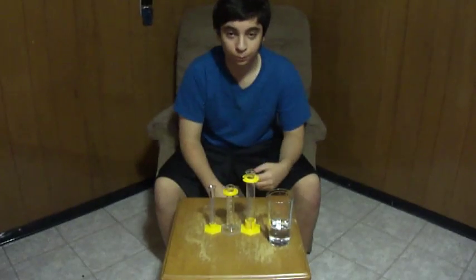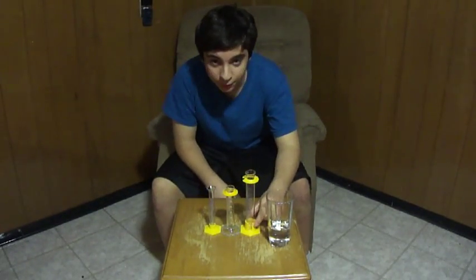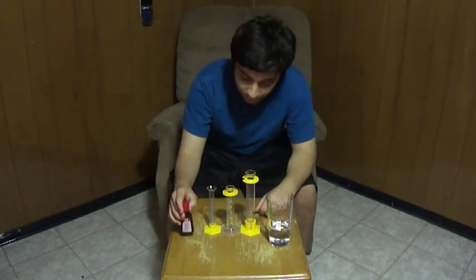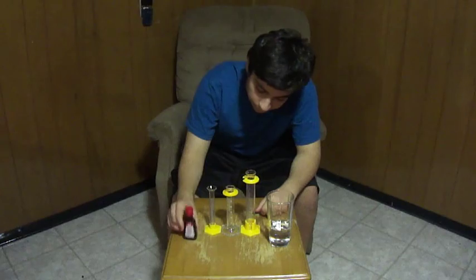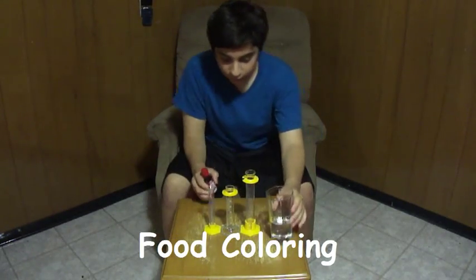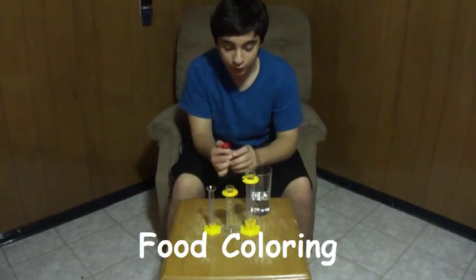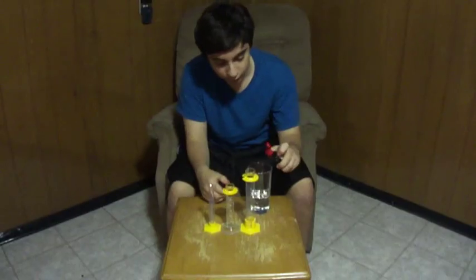what kind of level the water attains to in the graduated cylinder, I brought some food coloring, and I can just put some food coloring in the water so that it's more clear.